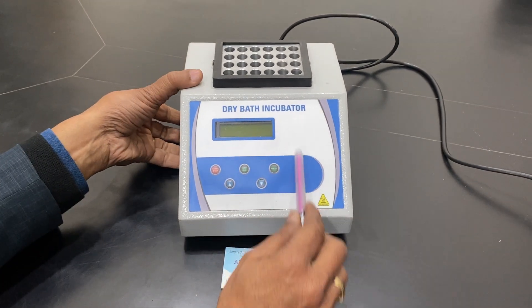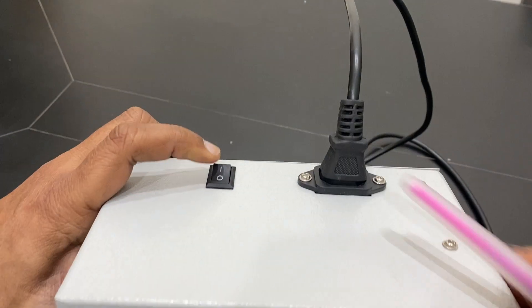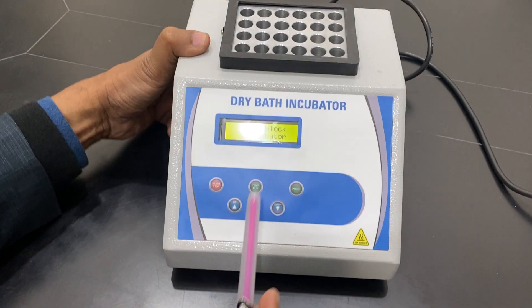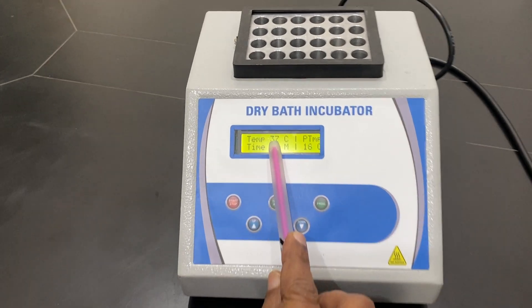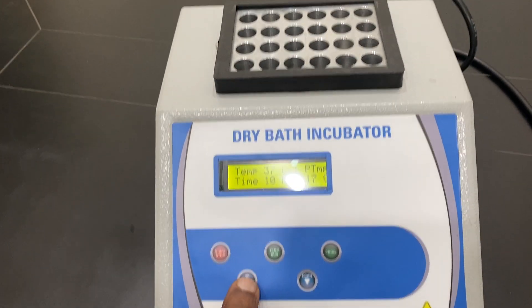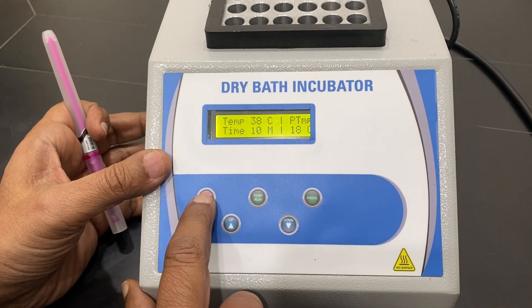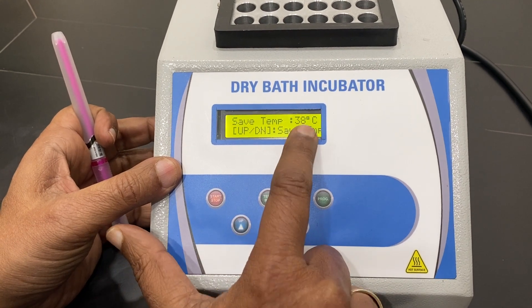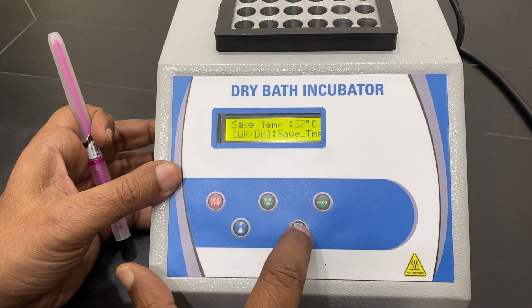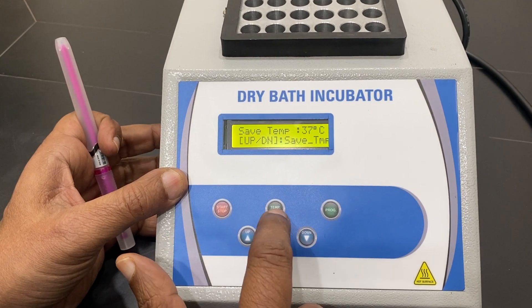This is our dry bath incubator by Apron. It is connected from the back — there is an on/off switch. When you switch it on, this becomes dry water. Temperature can be maintained at 37 degrees, or you can adjust it up or down. You can set the temperature and program it: enter the program, save temperature — 38 or down to 36 or 37 degrees — then set the temperature and run time.